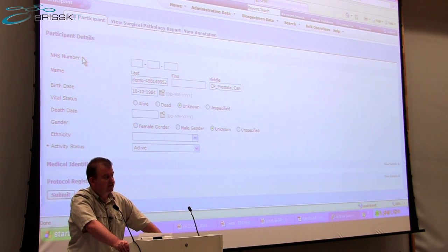As long as you've got a process that meets the appropriate regulatory framework for verifying consent, then you can model that either manually or automatically within Civi CRM. As I say, the GenVasc process is being fed from our pathology system on receipt of samples. That creates a participant, it builds relationships, and it also creates the study enrolment, all without any operator intervention.